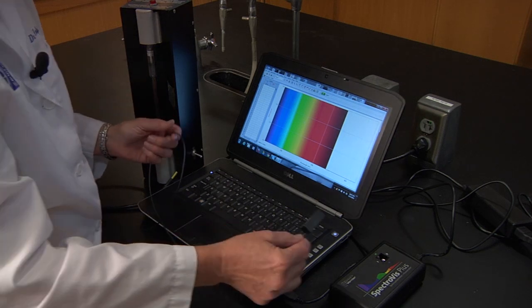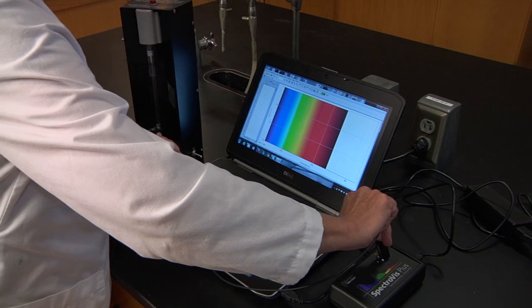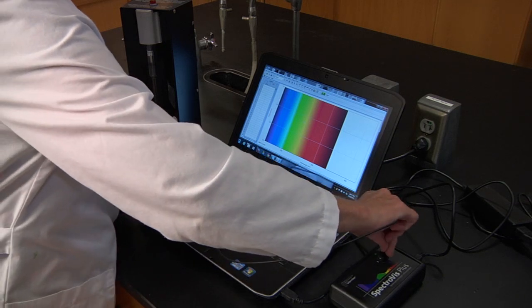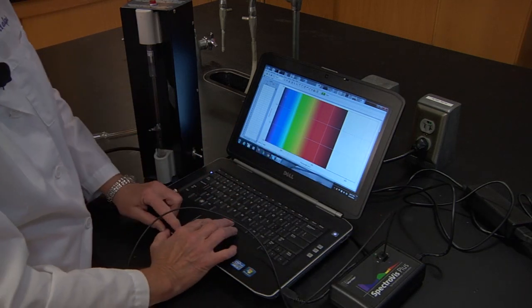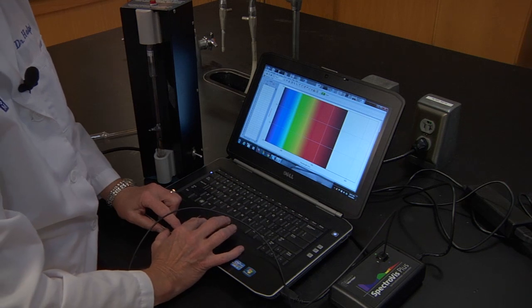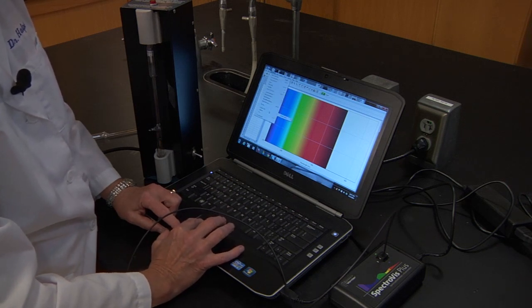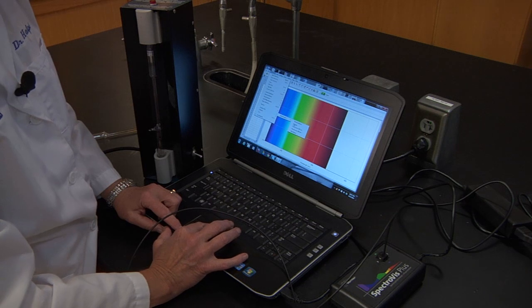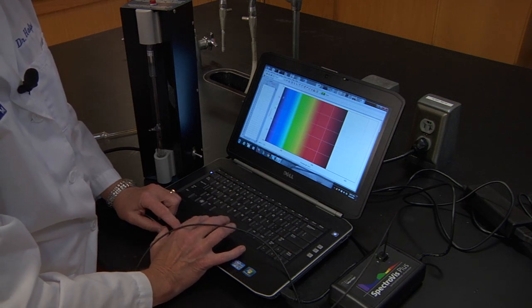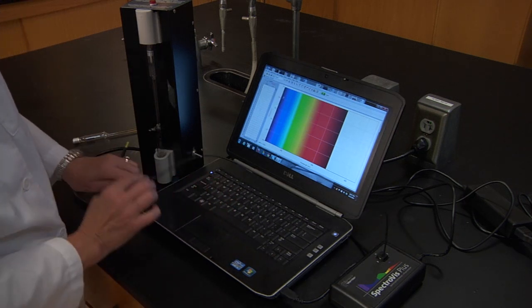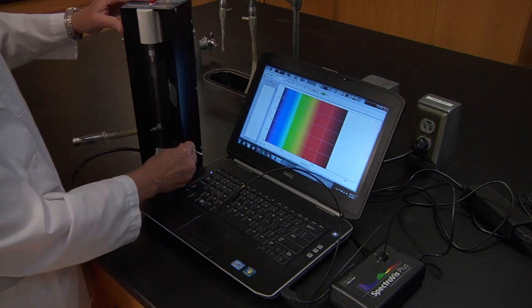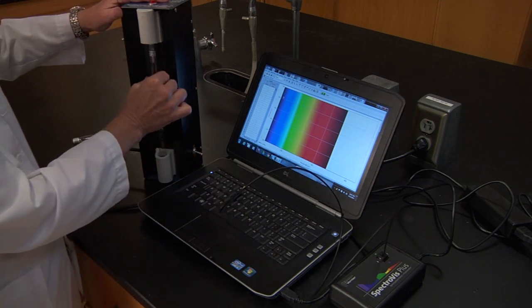So we're going to put our fiber optic cable in our spectrophotometer. We're going to tell our software that we want to measure intensity, and we're going to look at our hydrogen tube here.